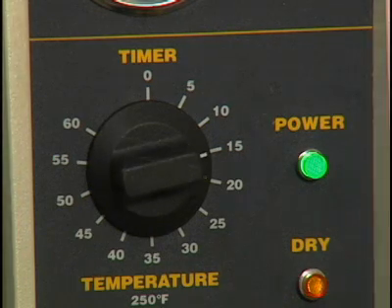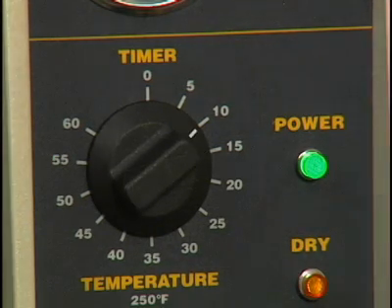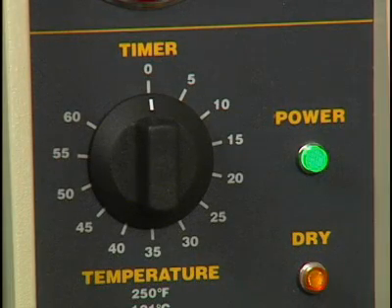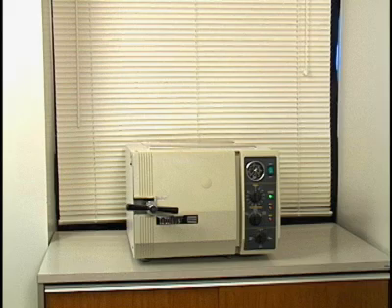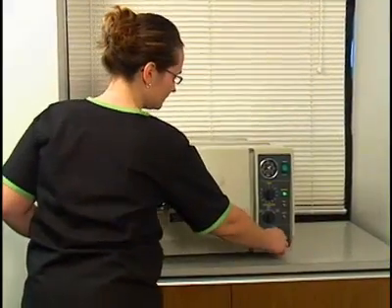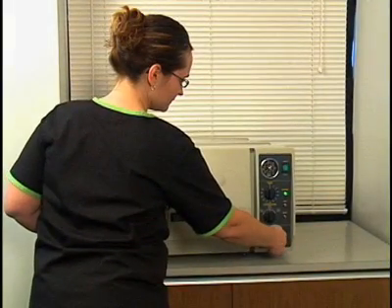At the end of the steam exposure time, an indicator light usually comes on or a beeper sounds. If the autoclave does not vent automatically, use the appropriate control to release steam from the chamber. You will hear a hissing sound as steam is exhausted from the chamber.